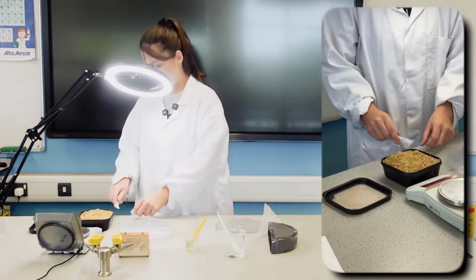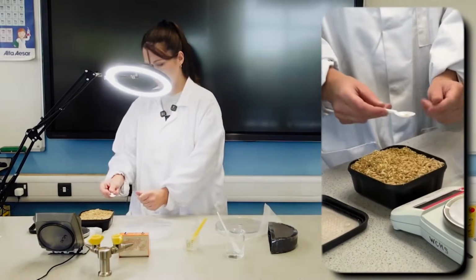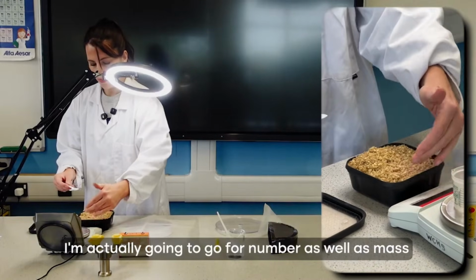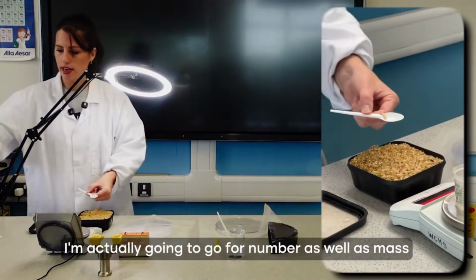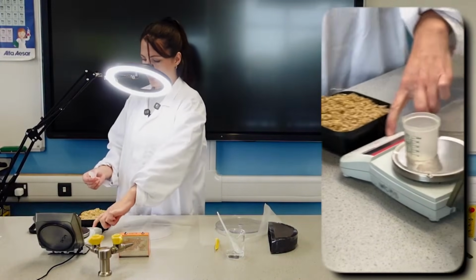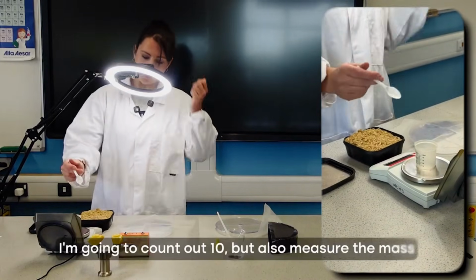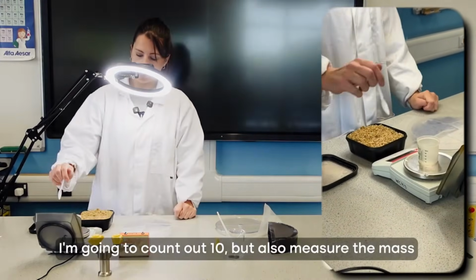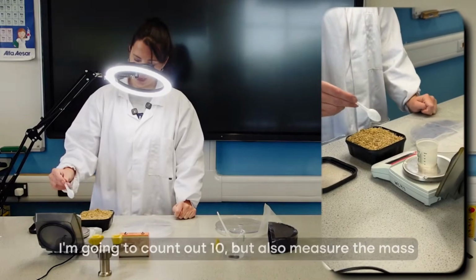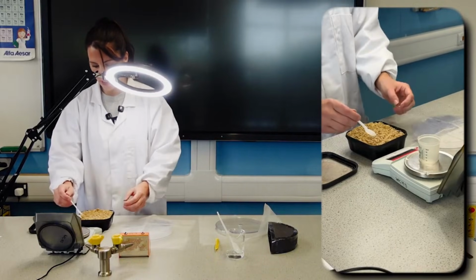As you can see, I've already lost one, so you do need to be really, really careful. I'm actually going to go for number as well as mass, so I can just compare that each time. So if there are any differences each time, we can see was the mass actually different. So I'm going to count out 10, but also measure the mass whilst keeping an eye on these maggots that are trying to escape. Students can wear gloves if they want. I'm choosing not to, but I'm going to be washing my hands at the end.